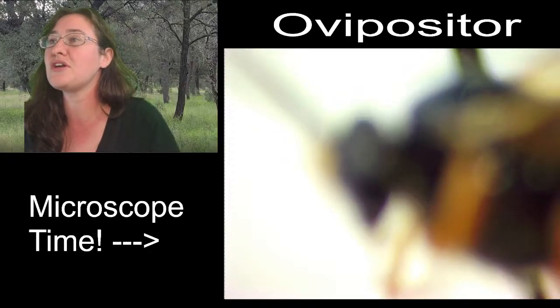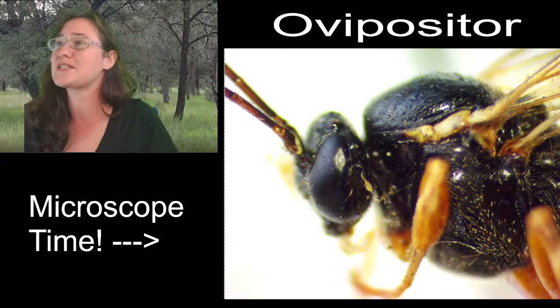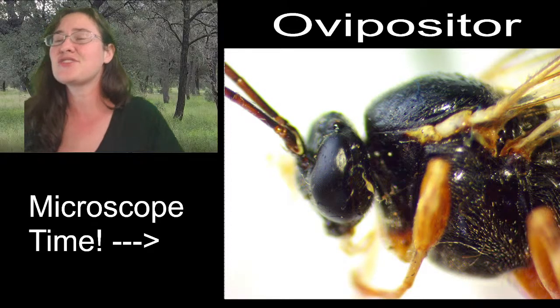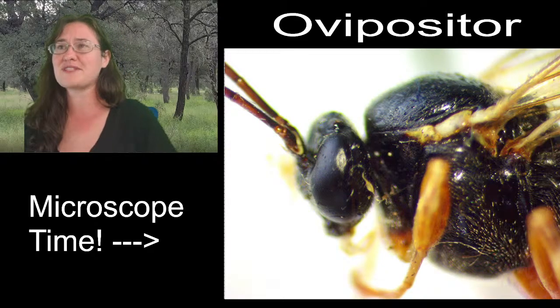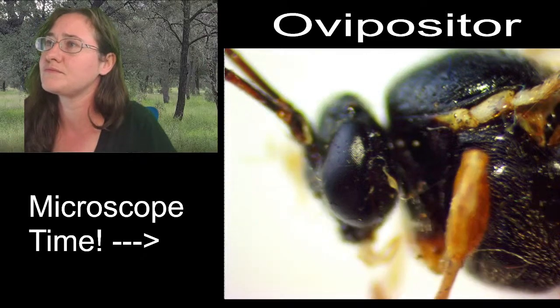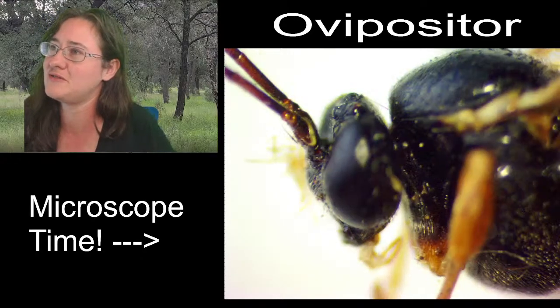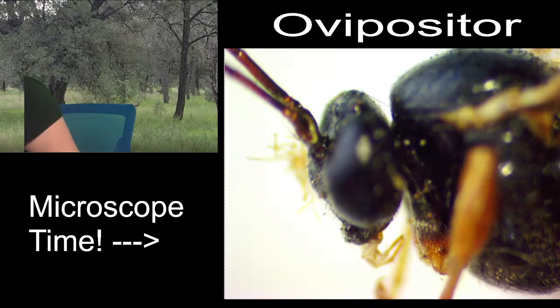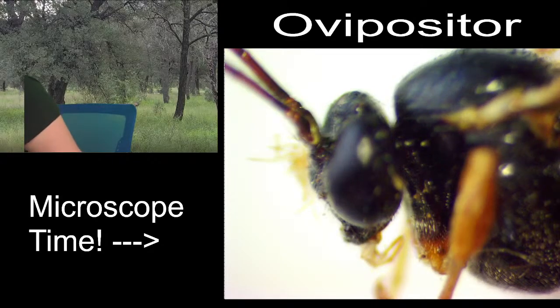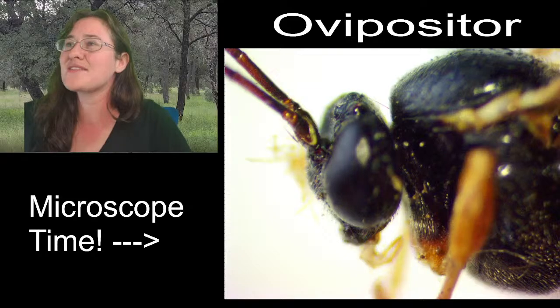Now, I was saying earlier that ichneumonid wasps are essentially the largest family of wasps that there is. And so they are very difficult to identify down to species because of that. Look at those mouth parts, though. She's got some palps. Well, I mean, she's got a pretty cool head, as it turns out. She's got interesting antennal segments.